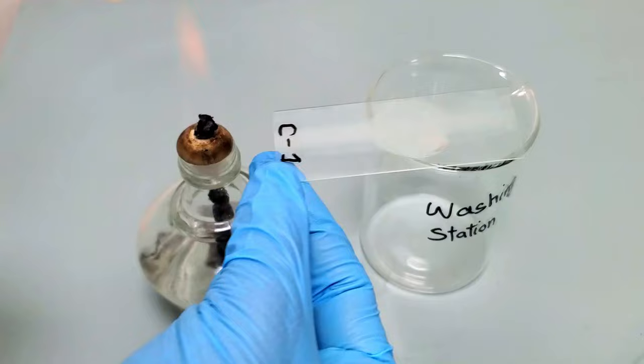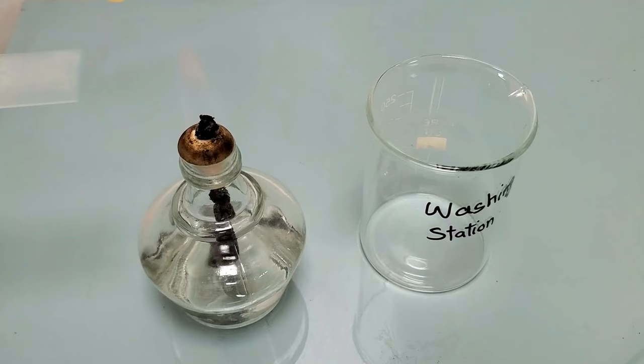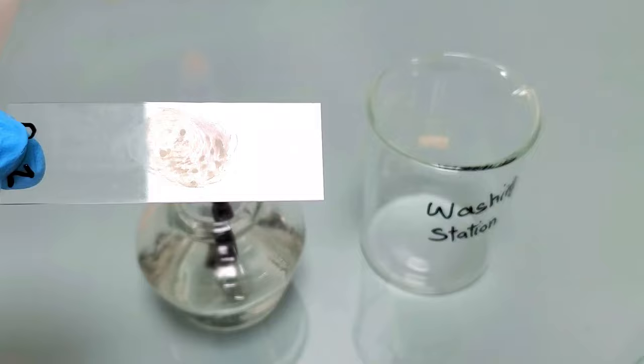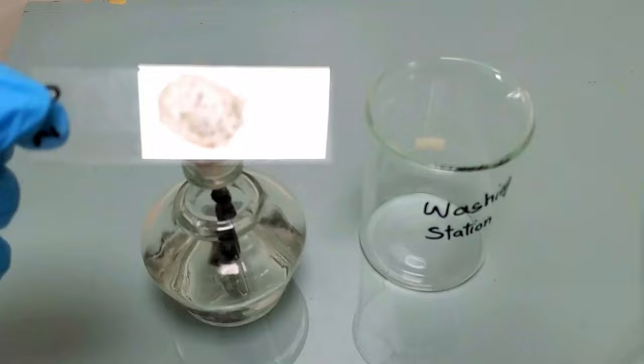Fix the smear on the slide by gently passing the slide over the flame 5 to 6 times. Fixing of cells is important to prevent the cells from being washed out during the staining process. Bacterial cells can also be fixed on the glass slide using methanol. For methanol fixation, add a few drops of methanol on the bacterial smear to cover the whole portion of the smear and wait for 2 minutes.